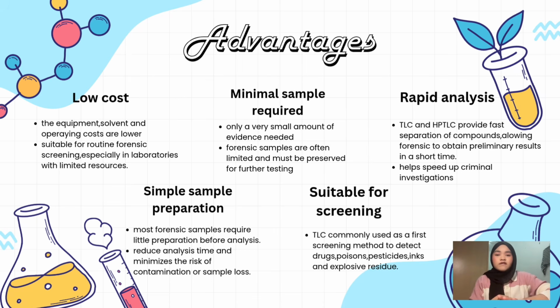The second advantage is that only a minimal sample is required. TLC only needs a very small amount of evidence for analysis. This is very important in forensic science because evidence collected from a crime scene is often limited and must be preserved for further testing if needed.